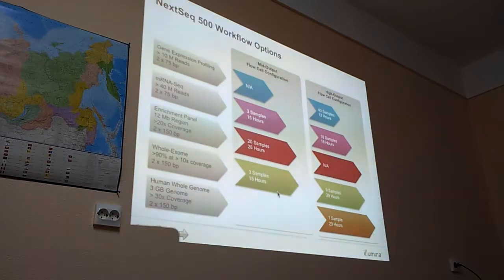Whole exome, here something between 3 on mid output or 9 samples on high output, and whole genome 1 sample in high output.